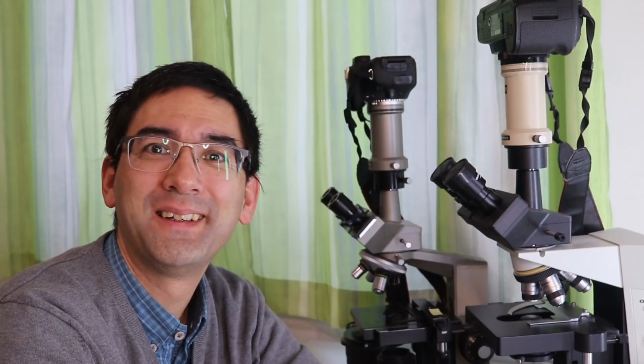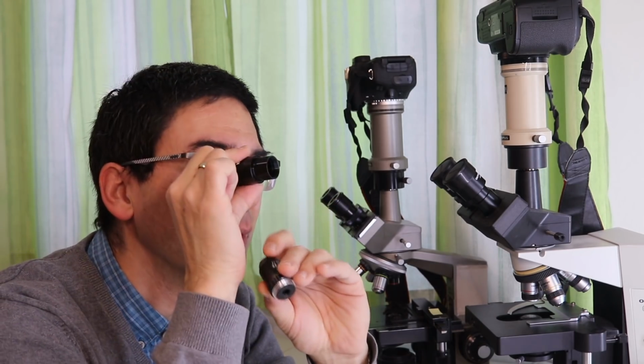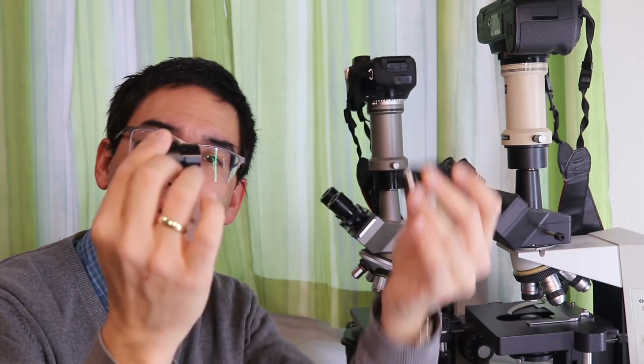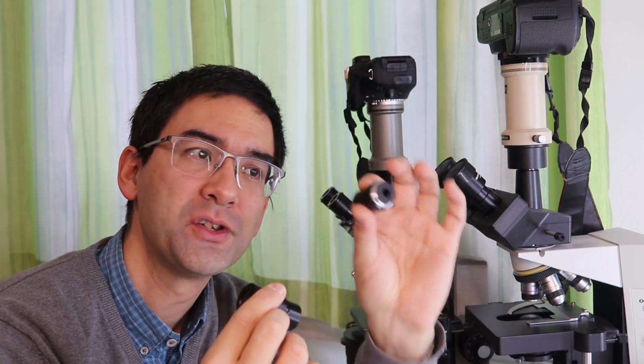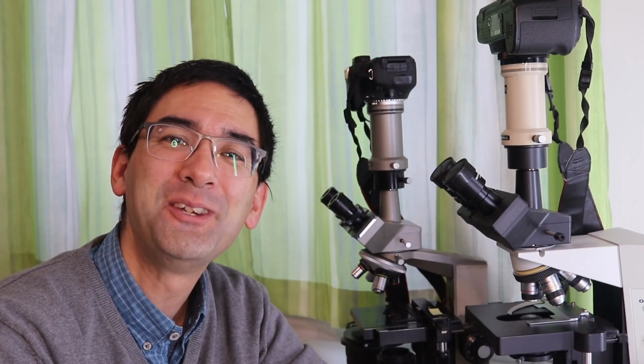Hello and welcome again. In this video I want to talk about microscope eyepieces. Eyepieces are those parts of the microscope where you look through. There is an objective here, and I've made several other videos on objectives, but today I want to talk about this part here, the eyepiece. So stay tuned.